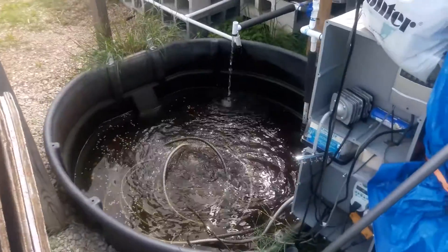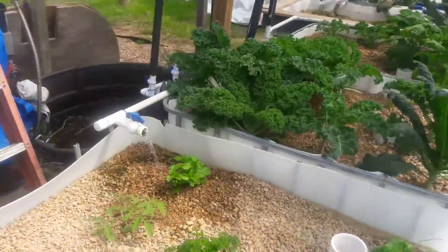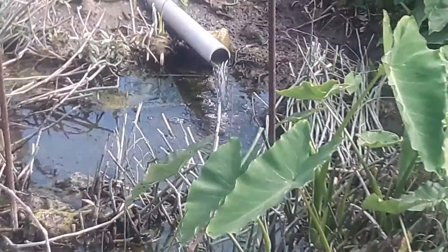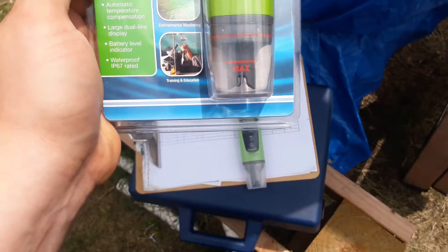We use it to test our aquaponics water — you can see our aquaponics pond here. We also use it to test our soap, our 20,000 gallon rain tank, the water in our duck pond, and we love the way that it works. So let's go ahead and pop this open and see what you get.